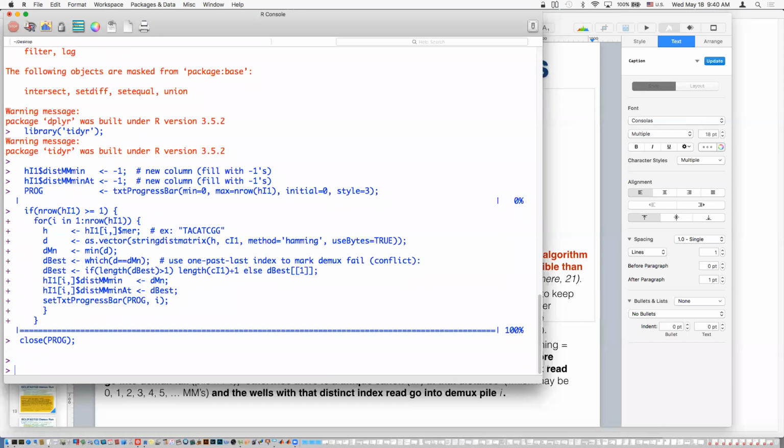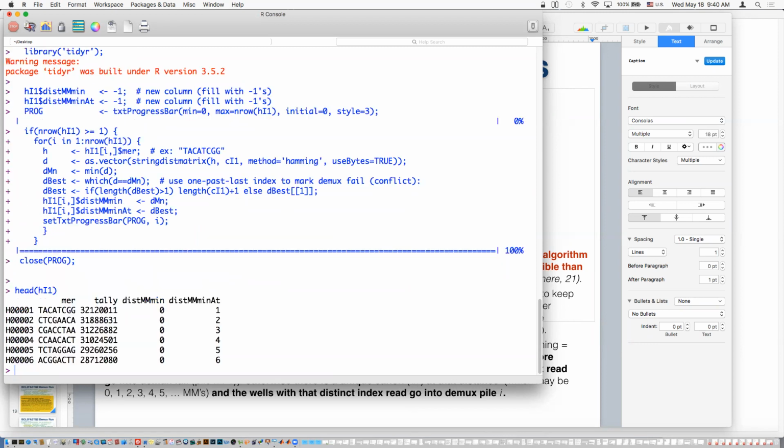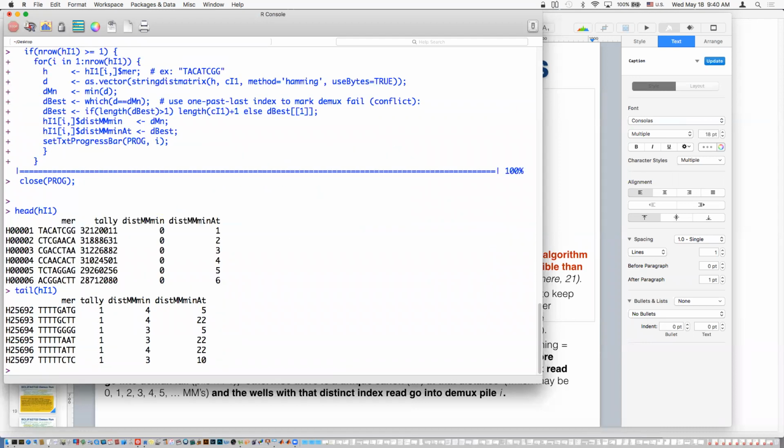Okay, let's look and see what we got out here now. I actually put the result in the same histogram we started with, right? So that our data frame just grew by 2 new columns, right? No surprise, we know that the beginning of the list is the canon guide, right? So actually, I think we numbered the canon in the order of 2 anyway. So minimum distance from the beginning is all 0, exact matches to canon 1, 2, 3, 4, 5, 6, and so on.